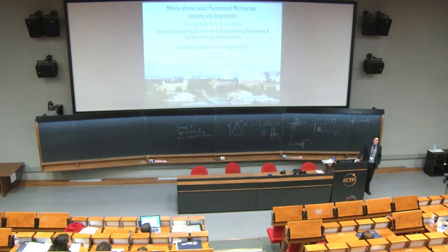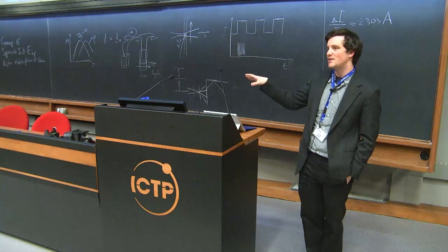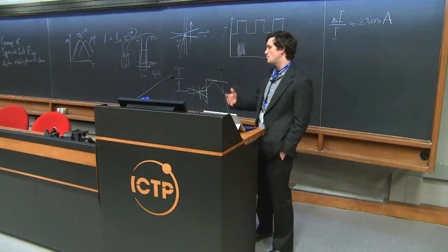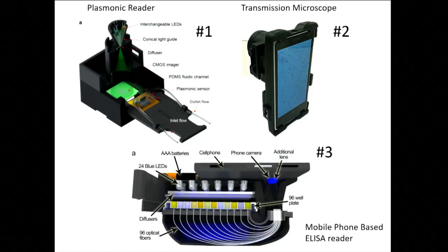All right, so this is going to be the hands-on part of the talk. I have some slides. I'm going to go through them quickly just so that everyone can have as much time as they want to look at the actual devices. But I want to explain just briefly what each of them does. So the first device I have is a plasmonic reader. I could talk forever about this because it's my project. And I have some slides coming up that have this in more detail.